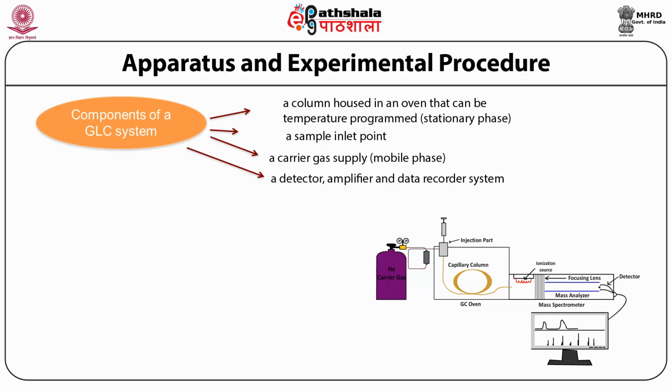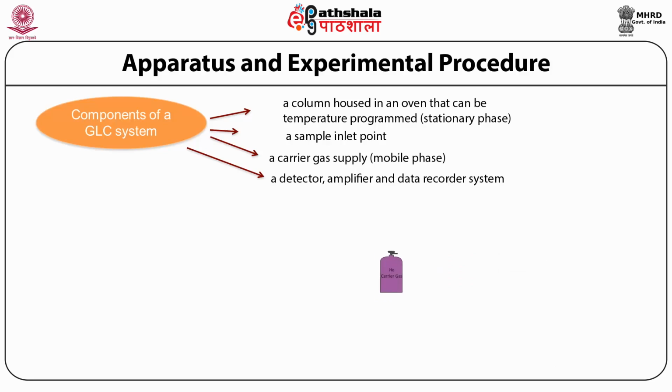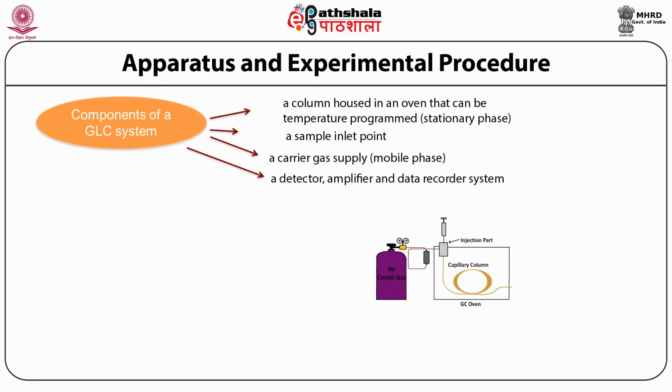So initially, everything in the column will move together, okay? But then, based on the affinities of the analyte towards the stationary phase and towards the mobile carrier gas phase, the lipid mixture would start to separate into individual lipids.